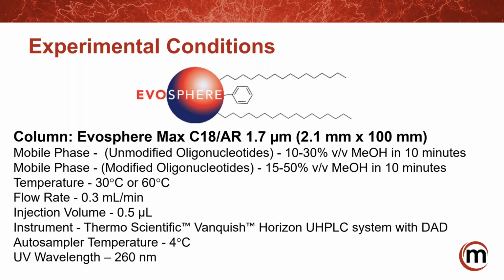We've really been excited about the fact that you're getting a lot of separation capacity. With ion pair, even with the coated hardware, you're still having to operate at the outsides of where the silica likes to be, so you tend to go to these hybrid silicas. They can work there, but the column doesn't want to be at that pH.